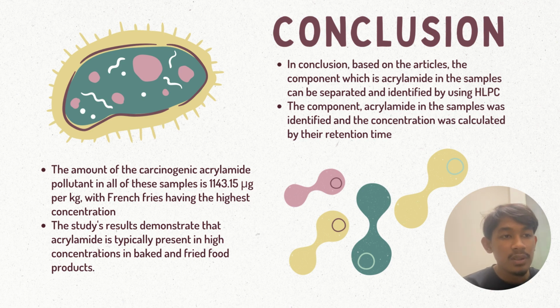The amount of the carcinogenic acrylamide pollutant in all of the sample is 1143.15 microgram per kilogram, with the French fries having the highest concentration.